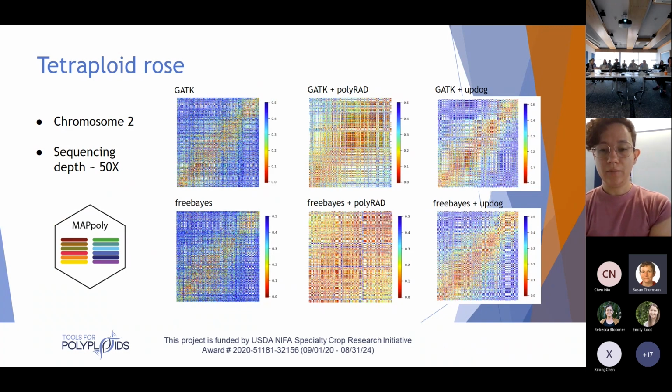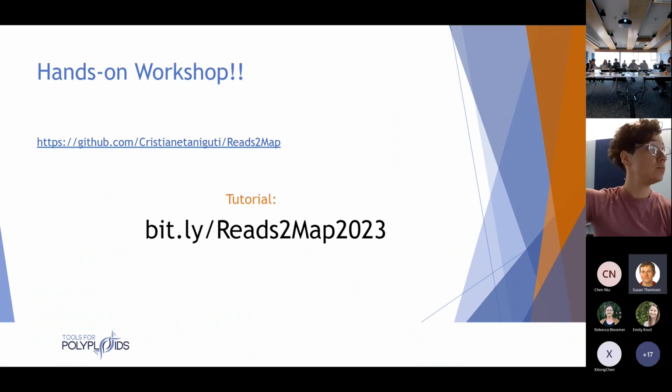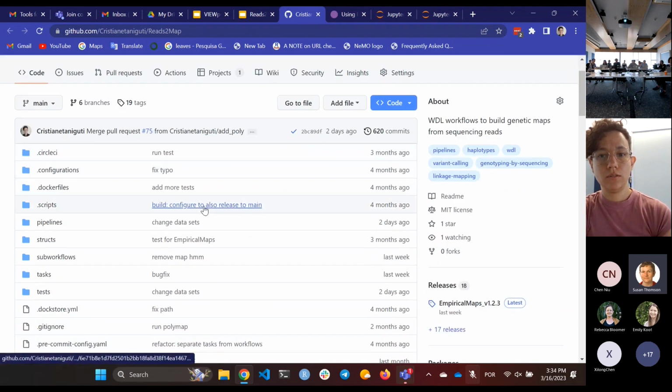That's why we have Reads2Map, because you can run your own data set and figure out your best practices. And this is the link for the tutorial. If you want to access this, what you will see in Reads2Map, I will open here. This is the home.